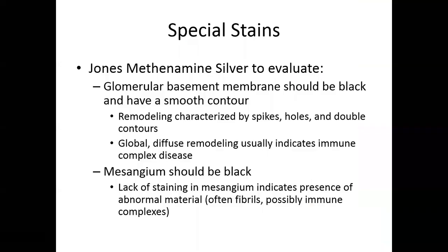Okay, Jones stain. I have plenty of people email me asking, can I just do a GMS, because my lab knows how to do a Gomori methenamine silver and they don't know how to do a Jones? A GMS is never going to work. It has to be a Jones. And it does take a while to work it up in your lab. Our lab and Texas A&M's lab does an amazing Jones stain.